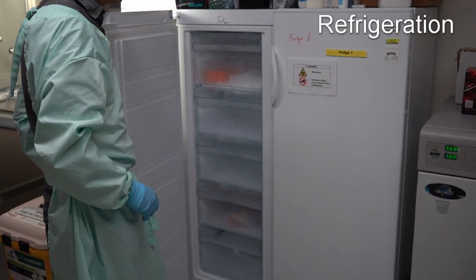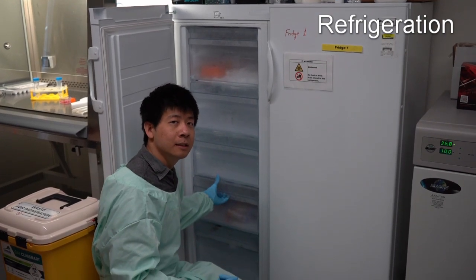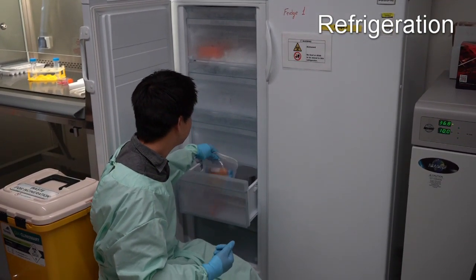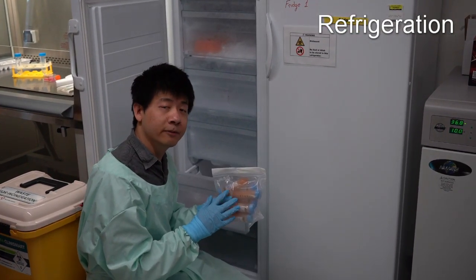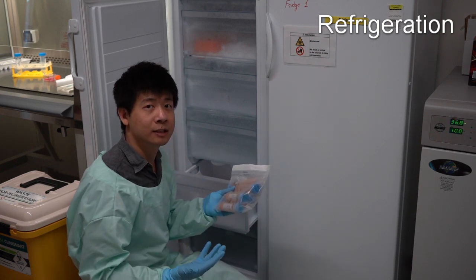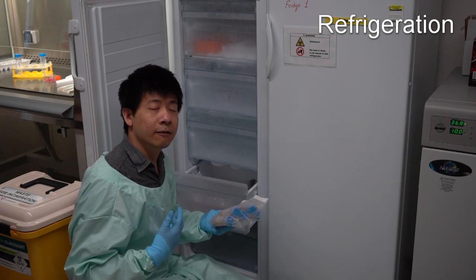The freezer is used to store various components required for cell culture. For instance, we have fillable vials here, which contain all the growth factors required for the cells to replicate.